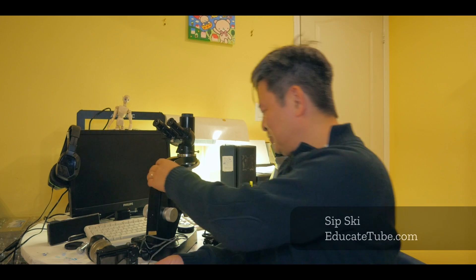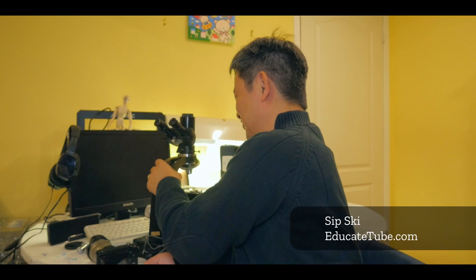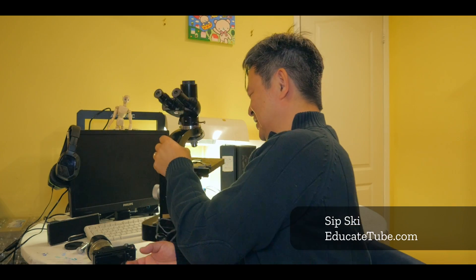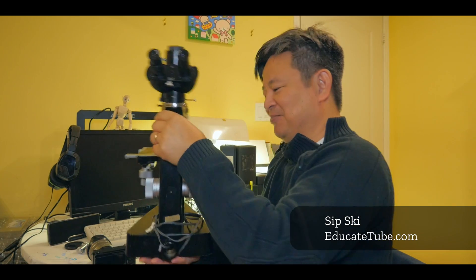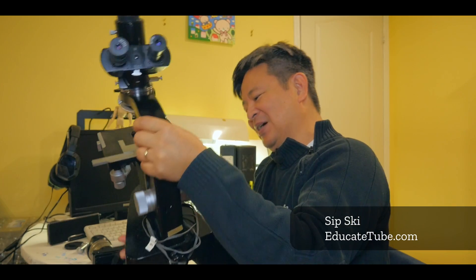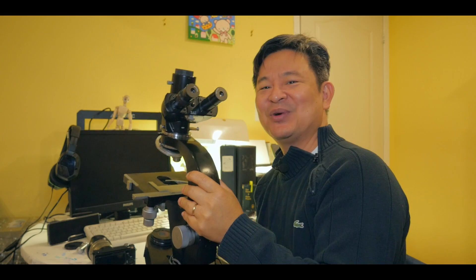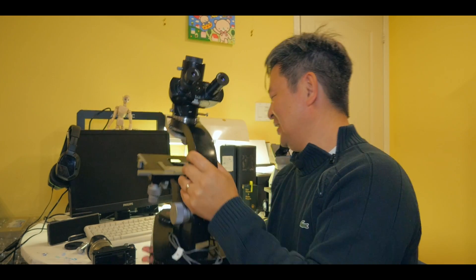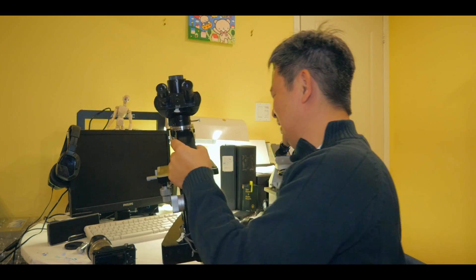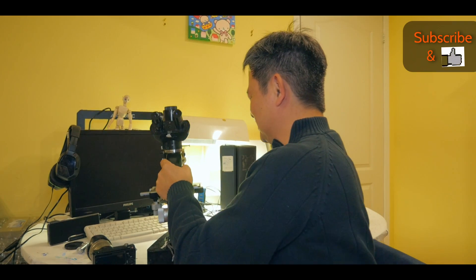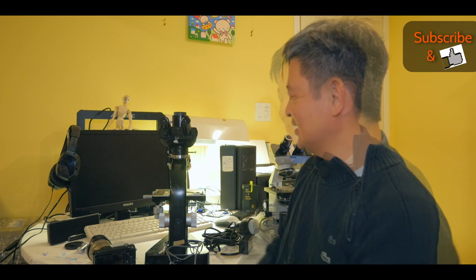All right, so here it is. I bought this beautiful, very heavy, made of solid metal here. You can see this is why I love a microscope that was made back in the 1970s, 1980s, even the 60s.